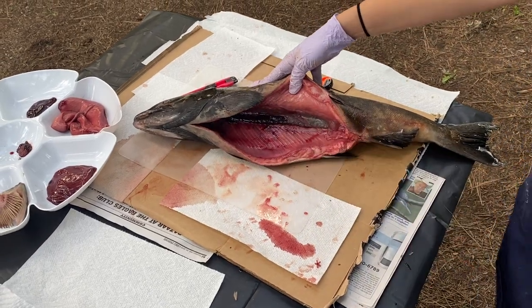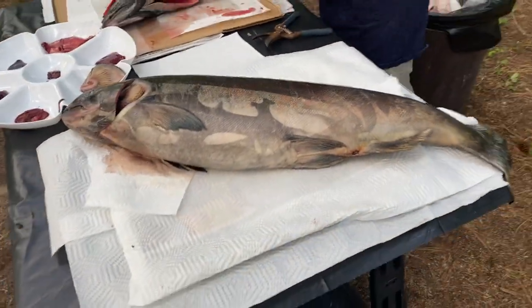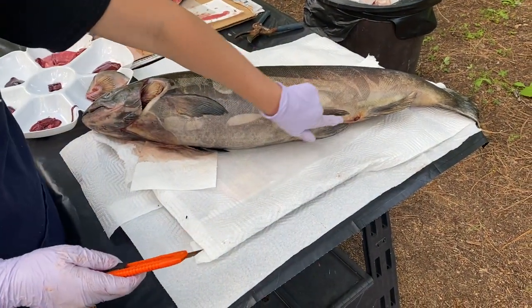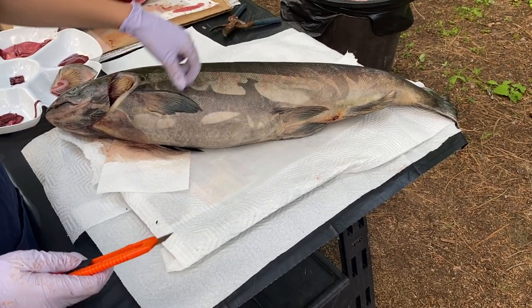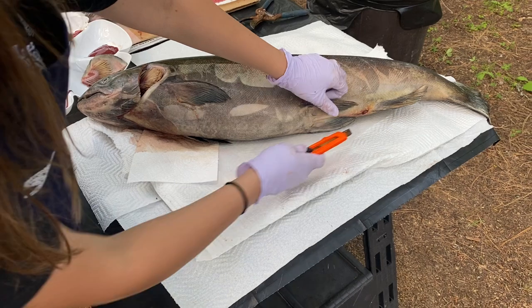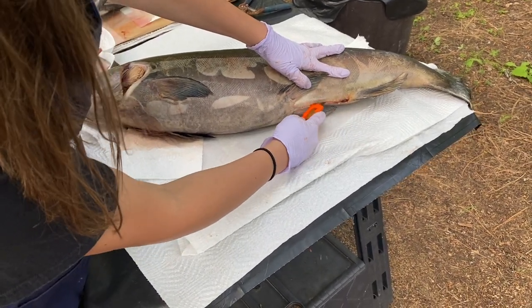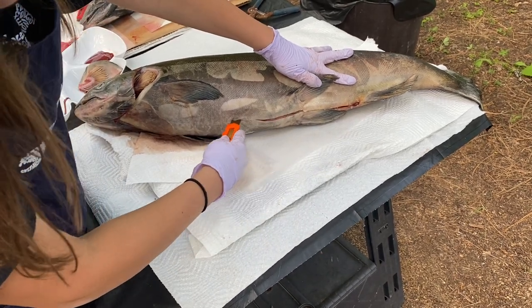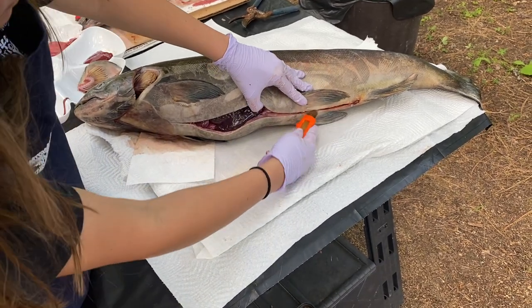So that was the male anatomy, and the female anatomy is the same, but we will open her up because she is a really, really big female. So I'm sure you guys want to see how many eggs she has inside of her. So I'm going to do the same thing. I'm going to cut from the vent. I'm going to go in between the, do you remember what these are called? Pelvic fins, and then all the way to the pectoral fins. Oh, we might be able to keep her eggs in the sacks, which would be super exciting.